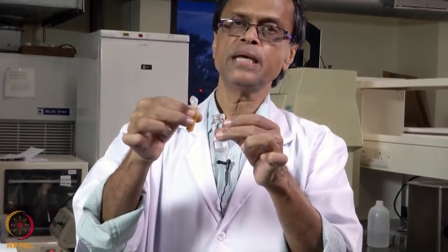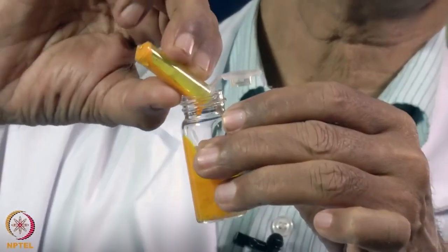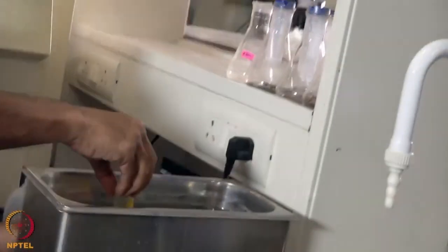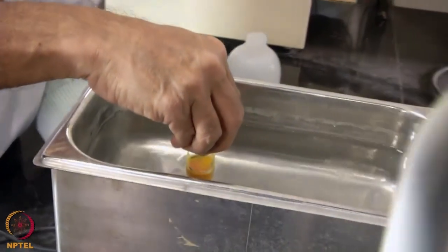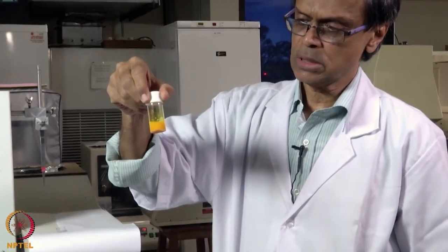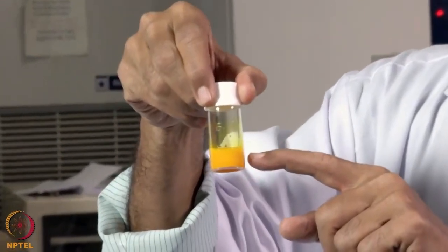We mix the curcumin in ethanol with the PVA dissolved in water together, and then again we mix them thoroughly in the water bath sonicator. This is the curcumin completely dispersed in PVA solution, and we are going to use this for coating the polyester film.